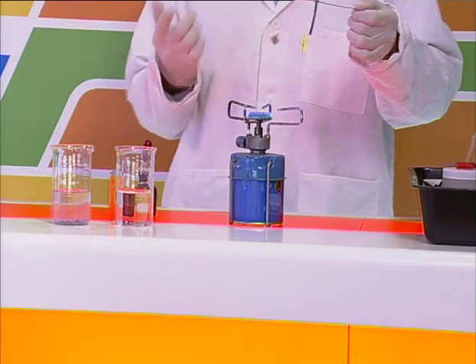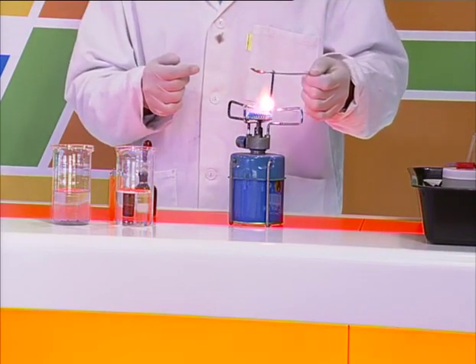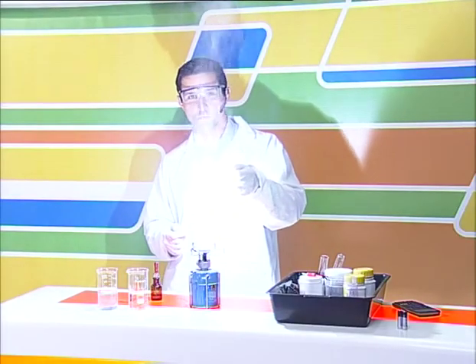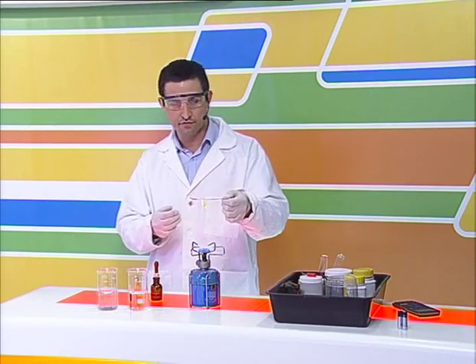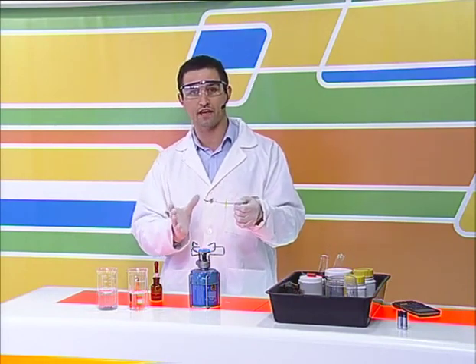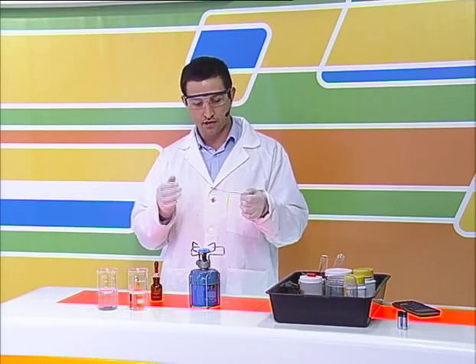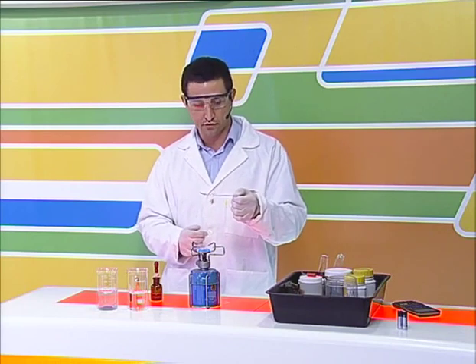So we're going to get this metal burning, and magnesium is known especially for this. It does take a little while to get going. There we go. You can see that incredibly bright light. You can actually see the redox is happening right in front of you. So what happened was that magnesium reacted with oxygen inside the air, a redox reaction happened, and we were actually able to witness it. I've actually got the product here, that's magnesium oxide, and that's quite cool.